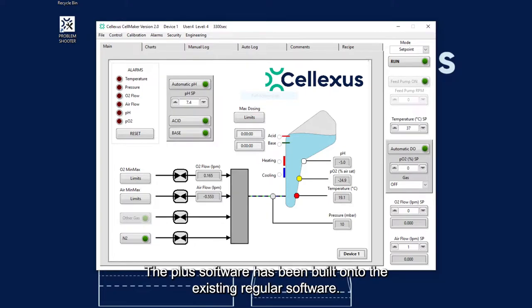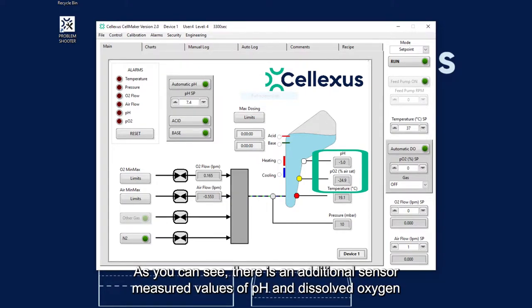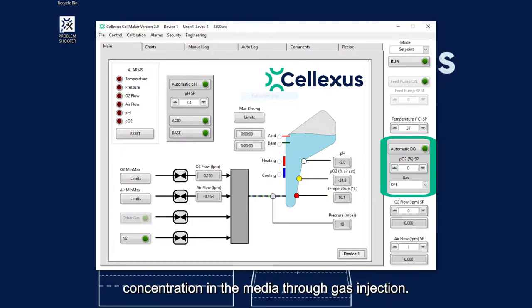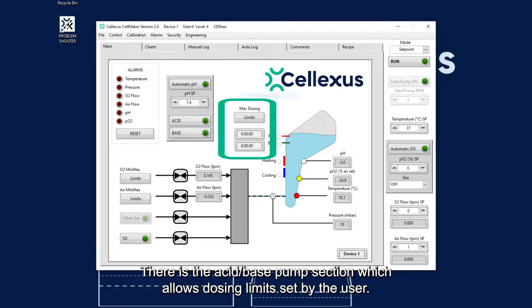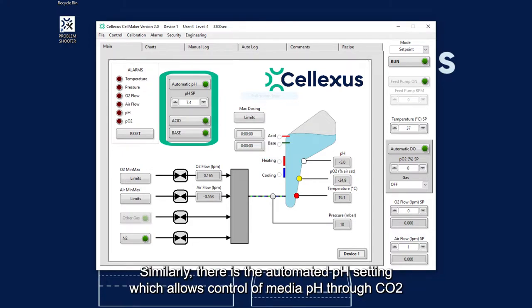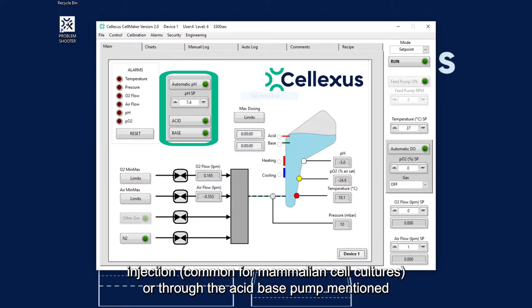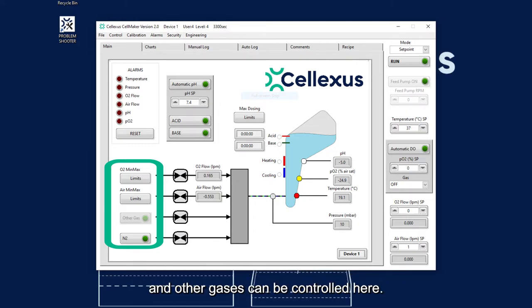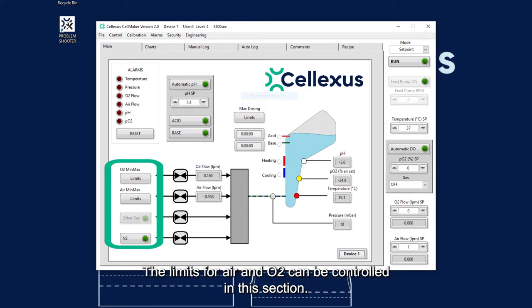The plus software is being built onto the existing regular software. And as you can see, there is an additional sensor measured values of pH and dissolved oxygen, PO2. There is the automatic DO setting, which allows you to automate the optimal dissolved oxygen concentration in the media through gas injection. There is the acid-base pump section, which allows dosing limits set by the user. Similarly, there is the automated pH setting, which allows control of the media pH through CO2 injection, common for mammalian cell cultures, or through the acid-base pump mentioned, which is common for microbial fermentation. The injection of the nitrogen gas, which can flush the system for anaerobic processes, and other gases can be controlled here. The limits for air and O2 can be controlled in this section.